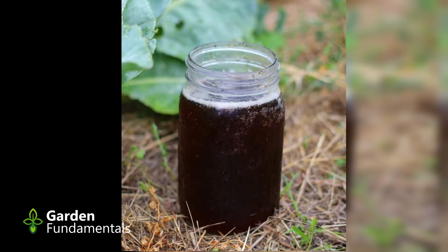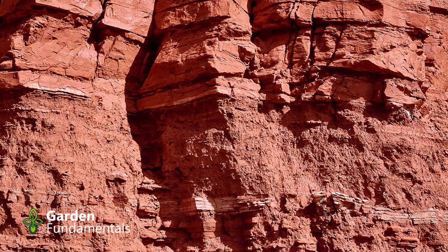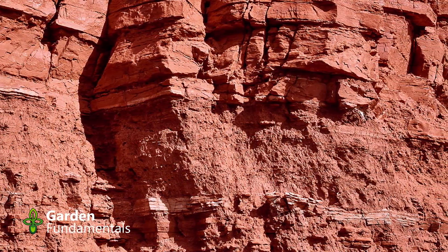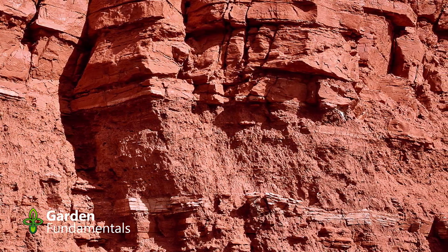So what does this mean? The test is actually measuring two things: color from the microbes and color from the soil sample itself. Soils have their own color — compost colors water when dissolved, compost tea picks up tannins from organic matter, and soil minerals like iron add color too. Some of you grow in red clay soil with a lot of iron; that coloration will affect the solution and skew the numbers you get from this test.